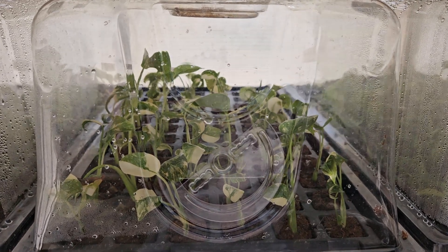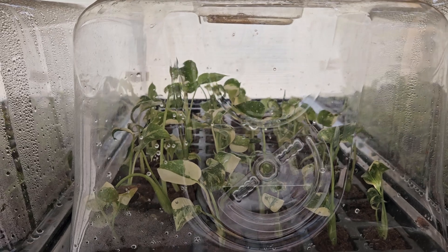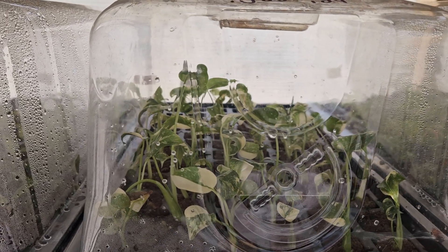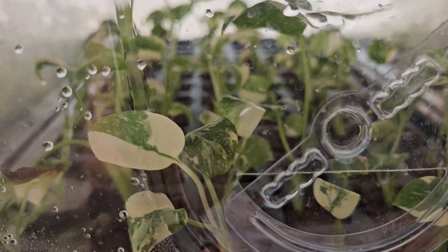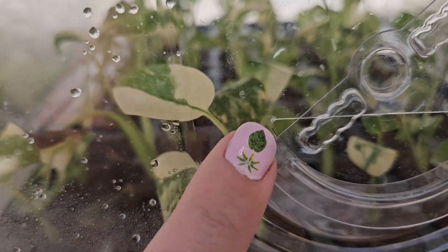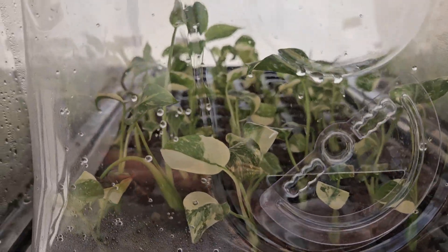Thank you so much for choosing us for your tissue culture journey. These cultures have been ready to be acclimated and are on day one or two. As you can see here, there is just a tiny little bit of crack in the lid, which is what we're allowing to get some air movement in there.